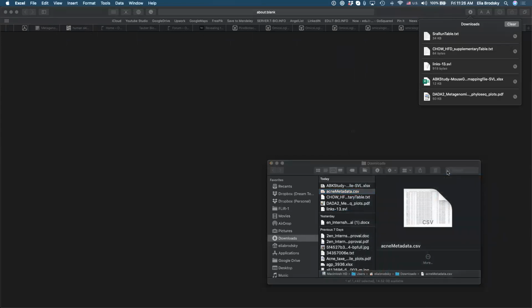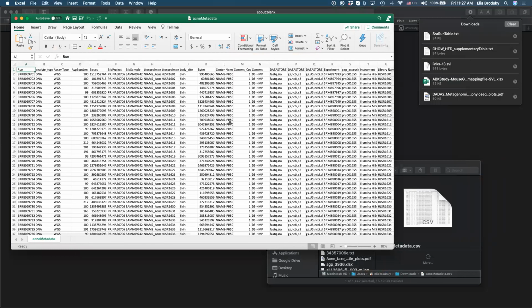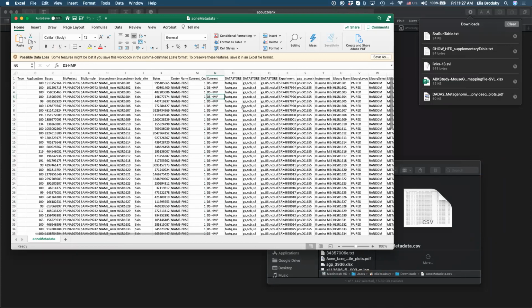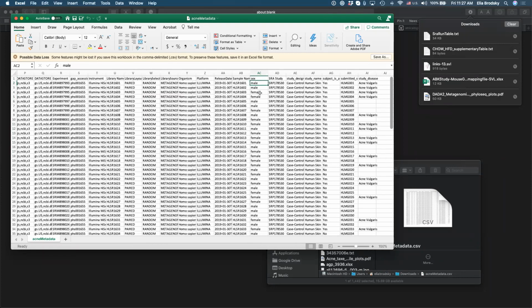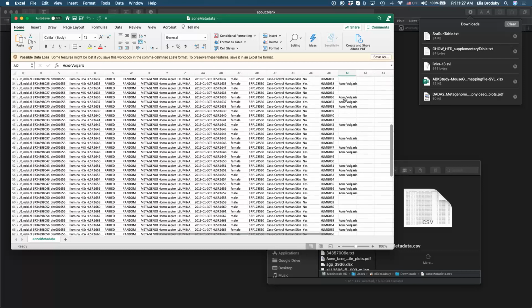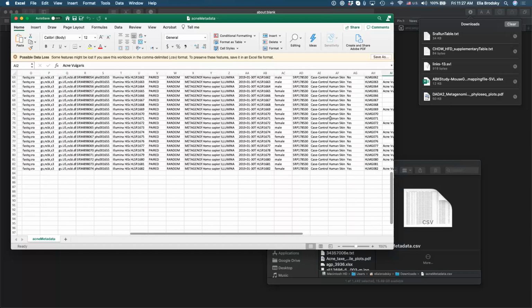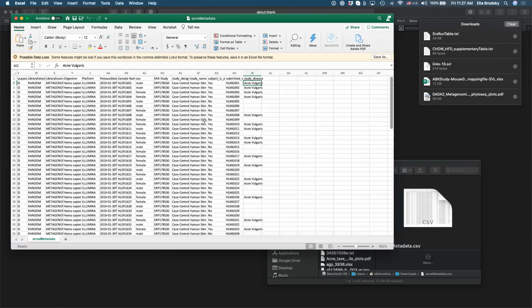And once you do, you can identify samples that you think might be interesting for a comparison, right? Our goal is to compare here. So if you go and you see here, there are several male and female patients. They have different disease type. So some of them do have acne, some of them are controls, they don't have acne. And so we can make a comparison between acne and non-acne skin.